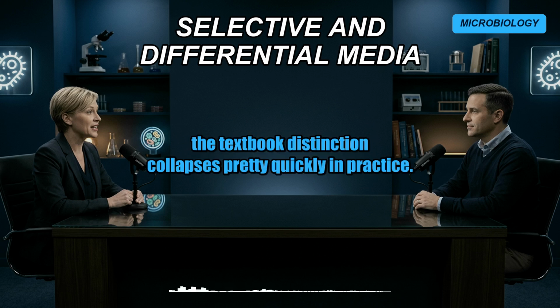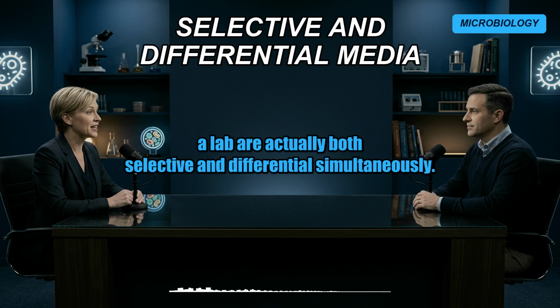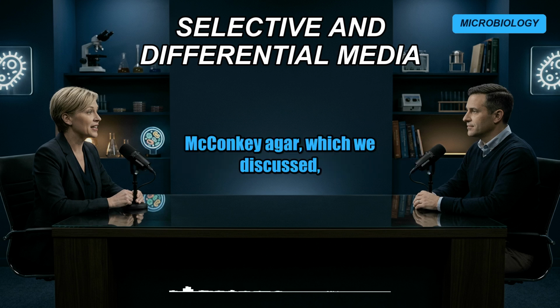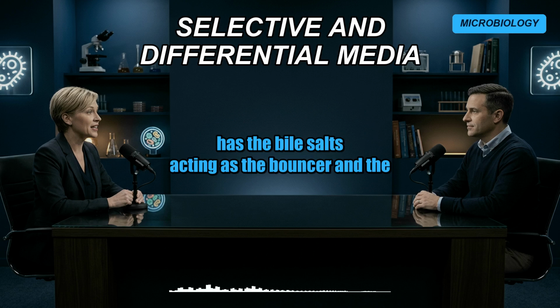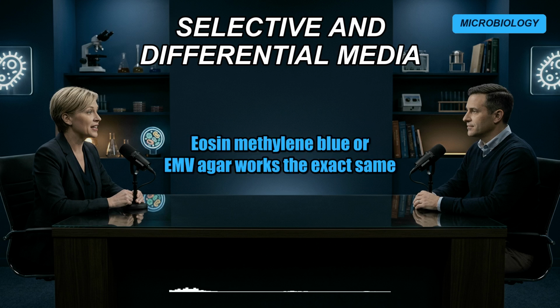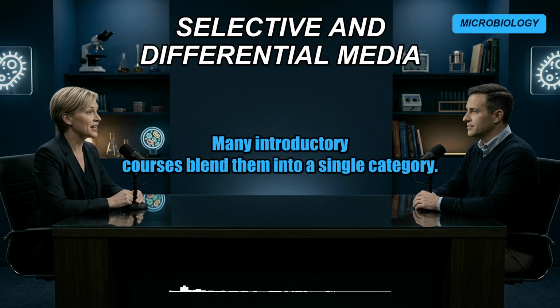Oh, the textbook distinction collapses pretty quickly in practice. The vast majority of the famous, everyday plates used in a lab are actually both selective and differential simultaneously. Like MacConkey. Right, MacConkey agar, which we discussed, has the bile salts acting as the bouncer and the lactose acting as the glow stick. Eosin-methylene blue, or EMB agar, works the exact same way. Because technicians use these combination plates constantly, many introductory courses blend them into a single category.